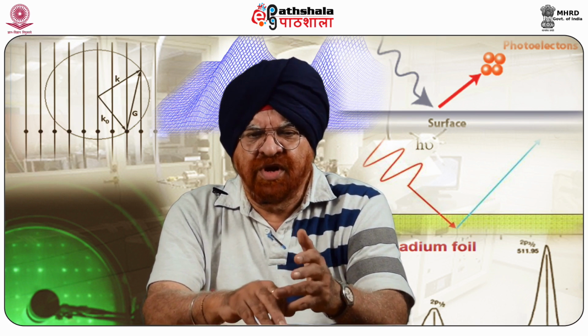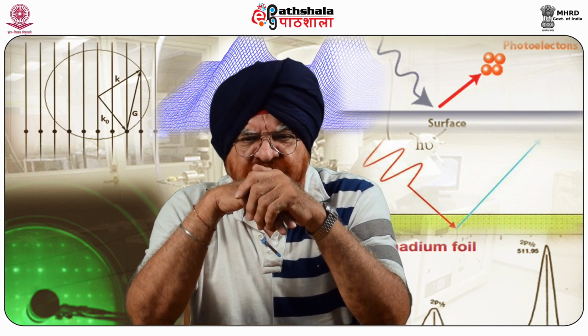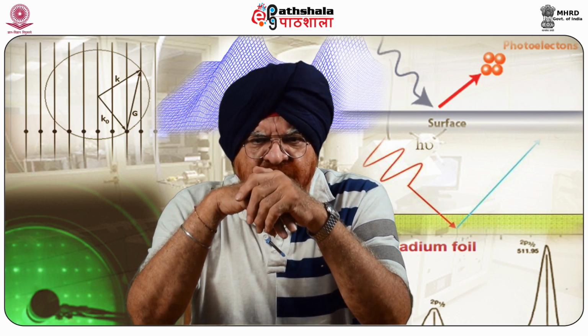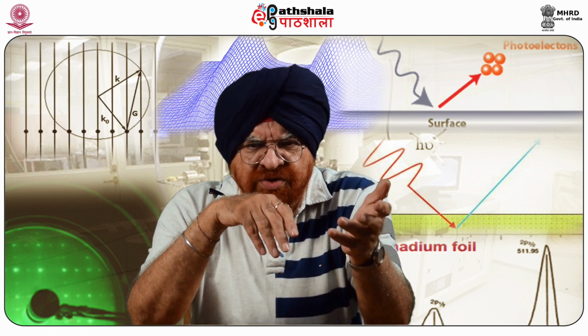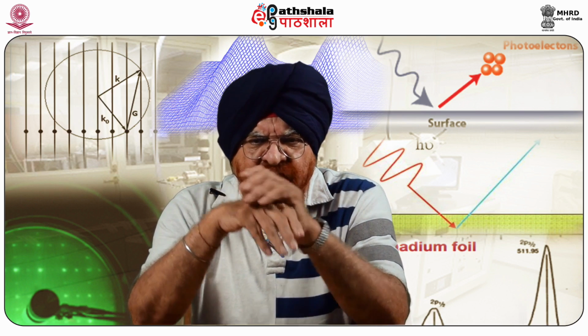These states could be N-doped silicon or P-doped silicon, that is metallic silicon in the figure given above, or silicon suboxide Si2O, or silicon monoxide SiO, or Si2O3, or silicon dioxide SiO2, or other higher order silicon oxide.